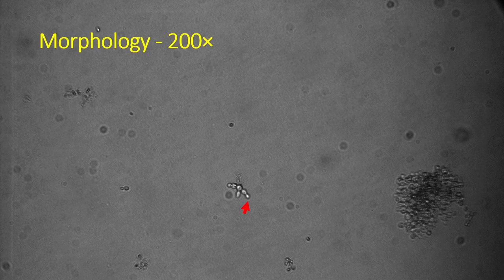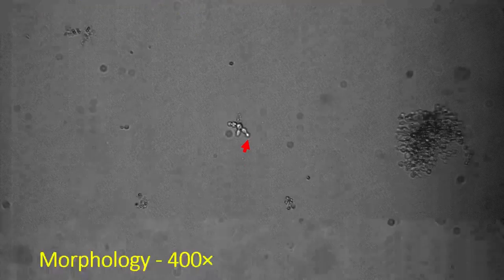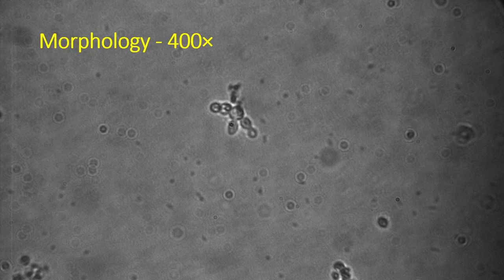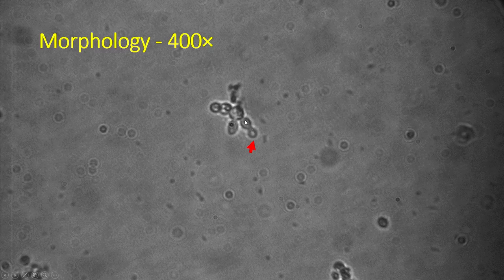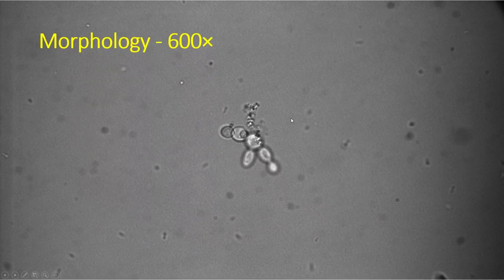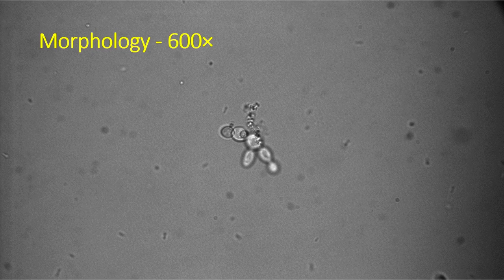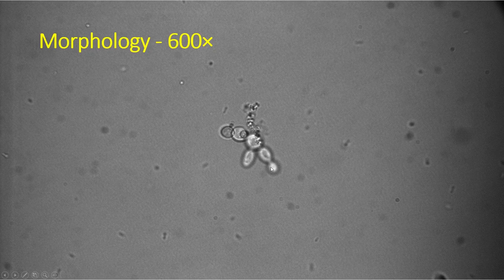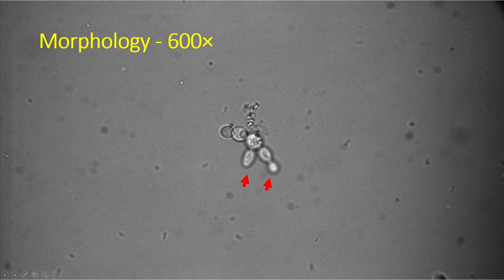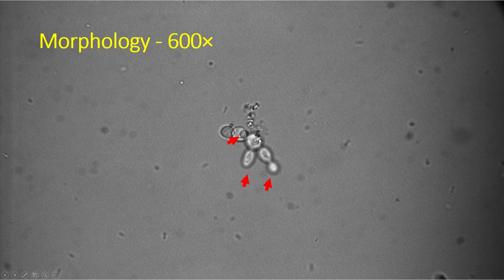Here we have a yeast — it might be budding, it might be two yeast stuck together. If we move up to 400x, so a 40x objective with a 10x ocular, we can see a yeast that appears to be budding, but it's still not super clear. If we move up to 600x, which is sort of the minimum magnification for real morphological analysis, we now have a much clearer picture. Here we have a mother cell, a daughter cell, clearly connected by a budding neck — so this is actually budding yeast. We have a second one as well. What probably wasn't obvious is this one here actually has a daughter cell budding from the mother cell below it, coming out towards us, which we couldn't even see at the lower magnification.